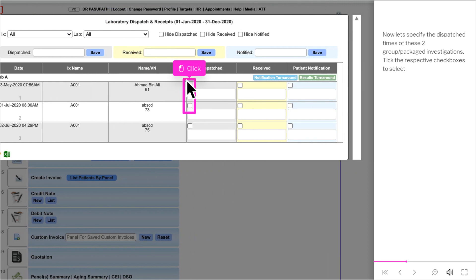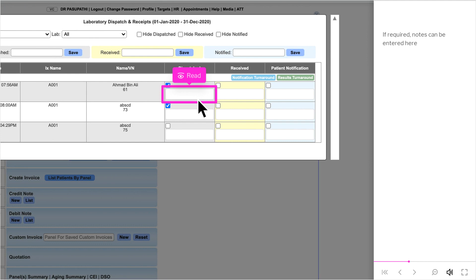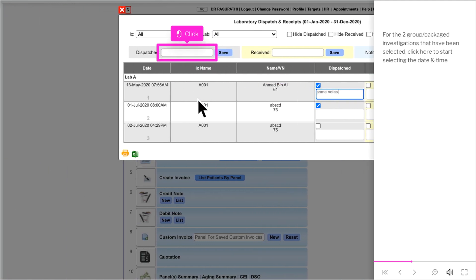Now let's specify the dispatch times of these two group or packaged investigations. Tick the respective checkboxes to select. If required, notes can be entered here. For the selected investigations, click here to start selecting the date and time.